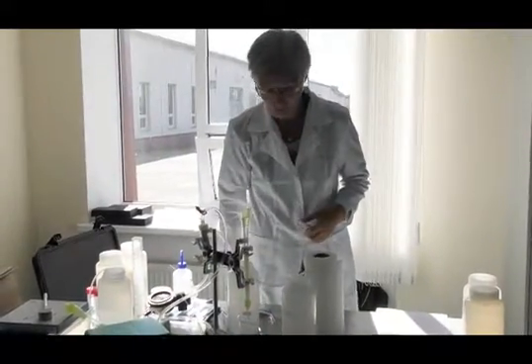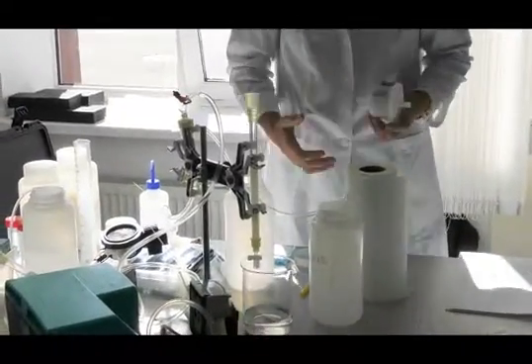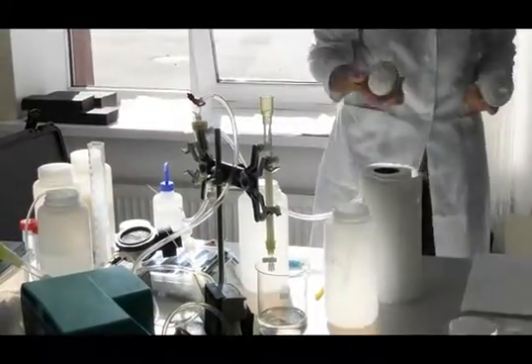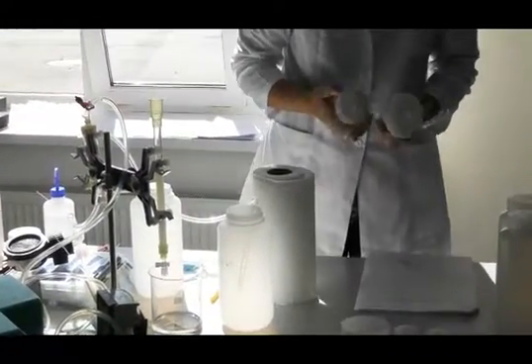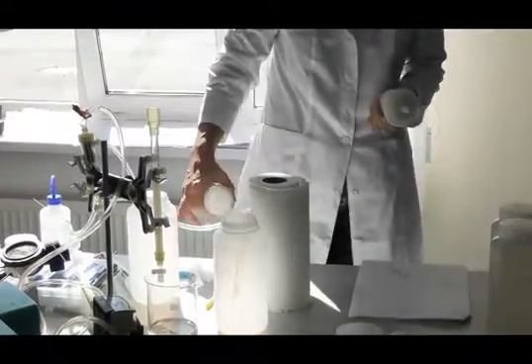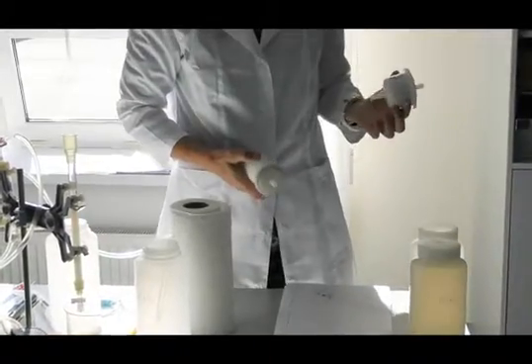We prefer to use housing filters that are meant for one-time use. They don't look too big, but they have a much bigger area than the small filters. This filter has an area of 3 square meters.